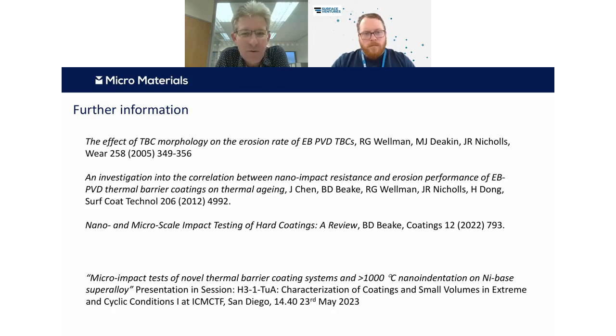The challenge in these things is always that the ultimate material has to be multifunctional. We can't just optimize for the one parameter. So this is the challenge for the guys at Cranfield University who are working with Rolls-Royce on this to try and develop these multifunctional coatings. With that in mind, our role in this is essentially to provide lab scale test methods that allow them to effectively screen all of the different possible contributions and allow them to drill down and get to the things that they want to look at and develop in more detail. Okay, yeah, it'll be very interesting to see the future work if the ICMCTF presentation goes well on all of this.